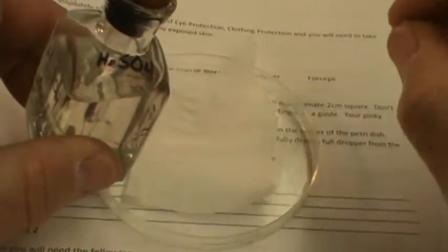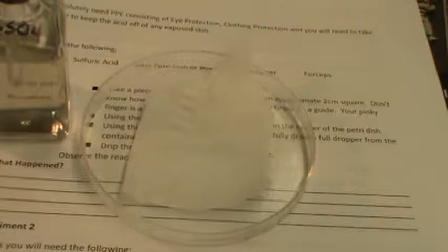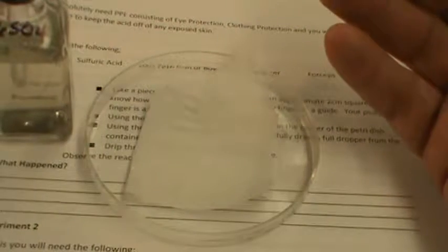We have some H2SO4. Now let's just review some acid rules. If we have gloves that we can wear, we should wear gloves, because if this gets on us, we can get a chemical burn on our skin, and it can leave a scar. If it gets on our clothes, we can burn holes in the clothes. That's not very nice either if mom and dad are buying our clothes for us. I'm going to be really careful, and I'm going to do this barehanded. If I do get it on me, I have baking soda that I can neutralize this with and save myself.